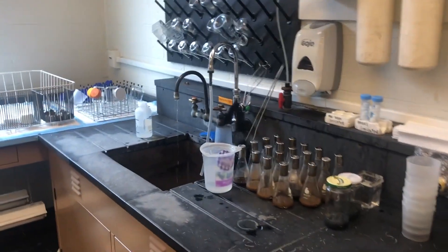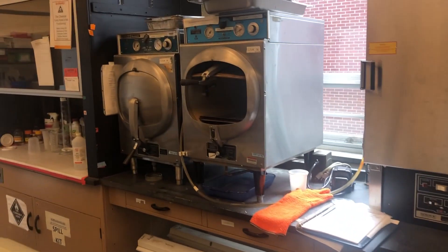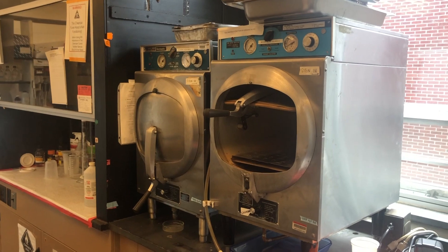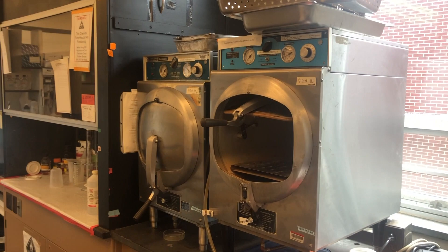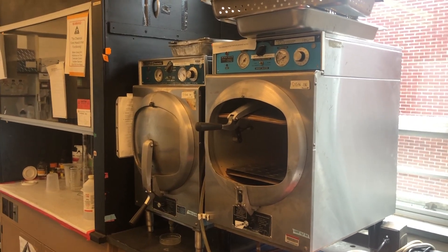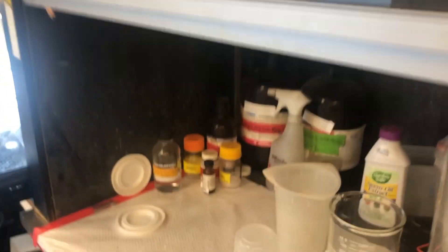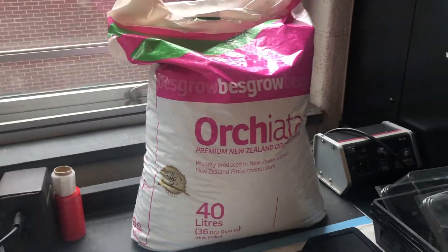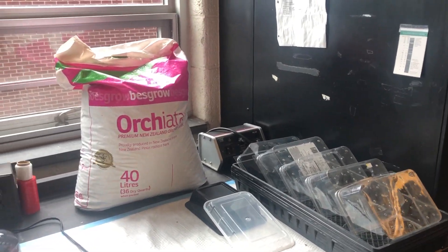Over here is the dishwashing area — a critical component of every laboratory. Over here are my two autoclaves, and these are really workhorses — bench top autoclaves. In the home, you can use pressure cookers to do the same type of thing that I do in the laboratory with autoclaves. Over here is a hood with negative flow — it pulls the air out. This is used when working with certain chemicals where you want to avoid the vapors.